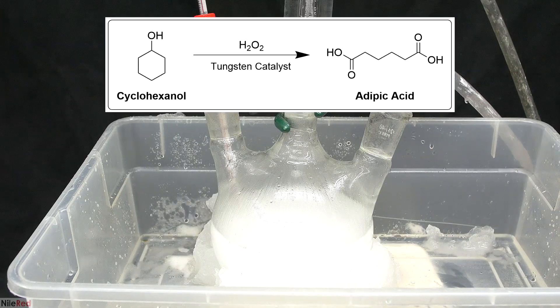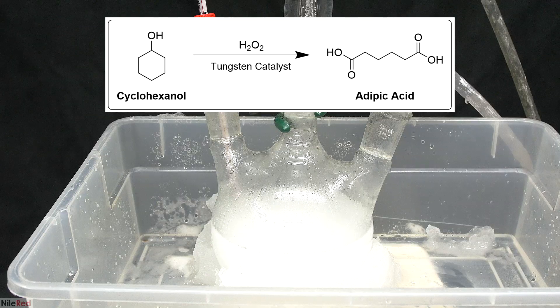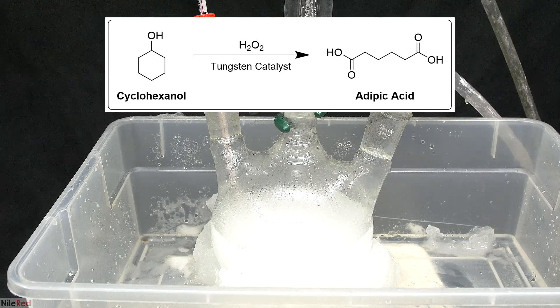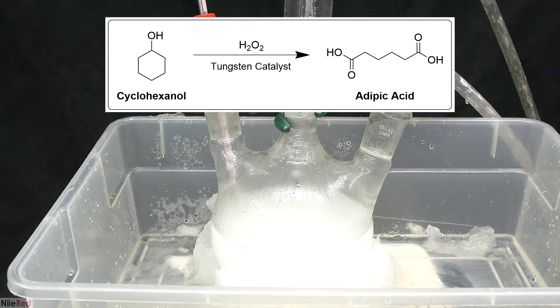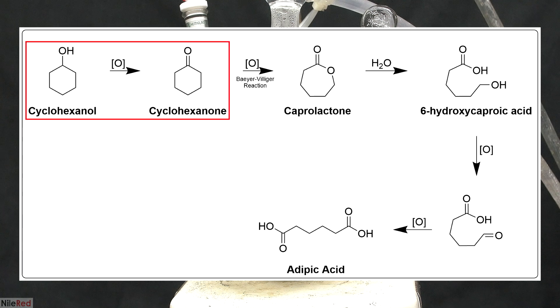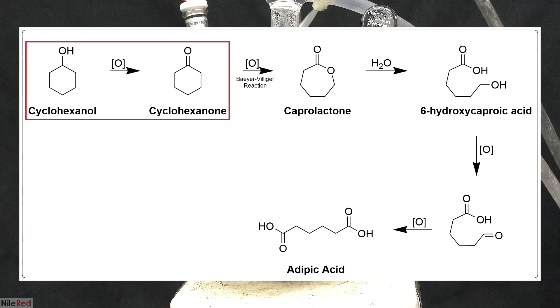This is the reaction that's supposed to be occurring. In the presence of the tungsten catalyst and hydrogen peroxide, the cyclohexanol is being oxidized to adipic acid. In terms of the mechanism, this is what was suggested by the authors of the paper. It starts with cyclohexanol, which is oxidized by peroxide to form cyclohexanone.